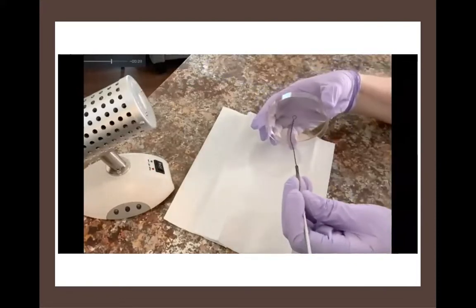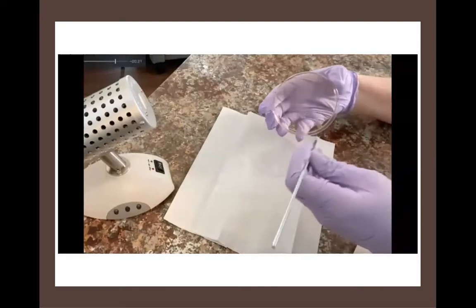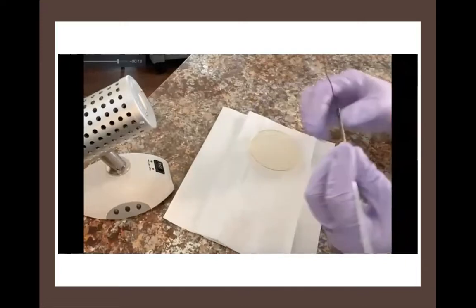Plate comes up, loop touches the media, and then without lifting it, I'm going to just streak it out, streaking it back and forth in a zigzag motion, spreading out those cells. As we go through the summer and we look at other techniques that we use in the microbiology laboratory, we'll also look at different ways that we can streak an agar plate, depending on what we want to achieve in terms of the growth of the cells.